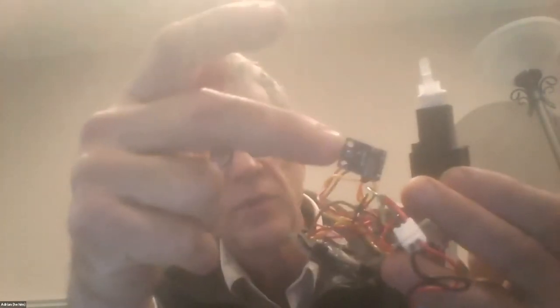Right now, these are the full electronics. This is the sensor, this board in here. And this is an orange LED, around 600 nanometers. That's kind of standard. It doesn't matter so much, but that's the proper standard. This will go nicely on this side and the other one. After that, we have this extra box that comes over it like a sleeve. Actually, drop it in. Okay, so this is what the whole thing is.